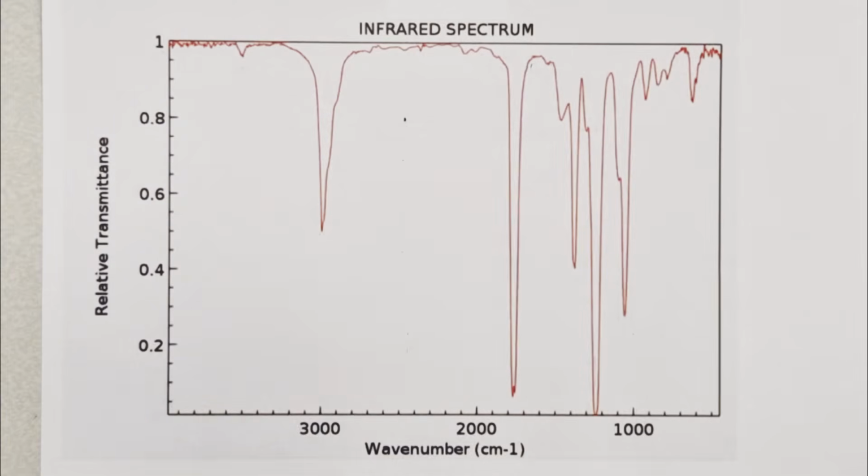I bet you've also seen that slightly shorter, but definitely sharp peak around 3,000. And you're going, yep, I know what that is now. That is indicative of the absorption relating to carbon-hydrogen bonds and their vibrational modes, and that's why that's there. And again, you are spot on. So we've definitely got a carbon double bond oxygen in this molecule. We've definitely got carbon-hydrogen bonds. But that's not the whole story. Is there anything else that might be drawing your eye?